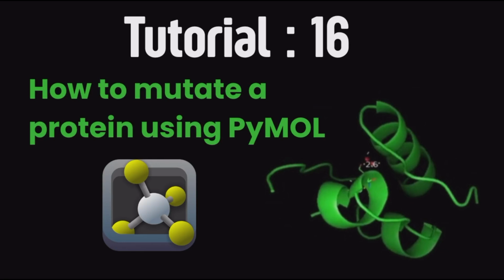In this tutorial, I am going to show you how to induce mutation in a particular protein. By mutagenesis, you can get mutant protein from normal crystallographic structure or any normal 3D structure. And by mutagenesis, you can study the comparative dynamic behavior of mutant protein versus normal protein.